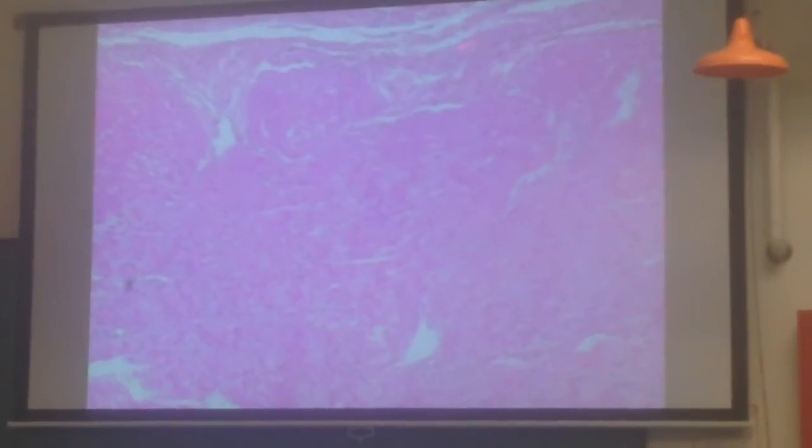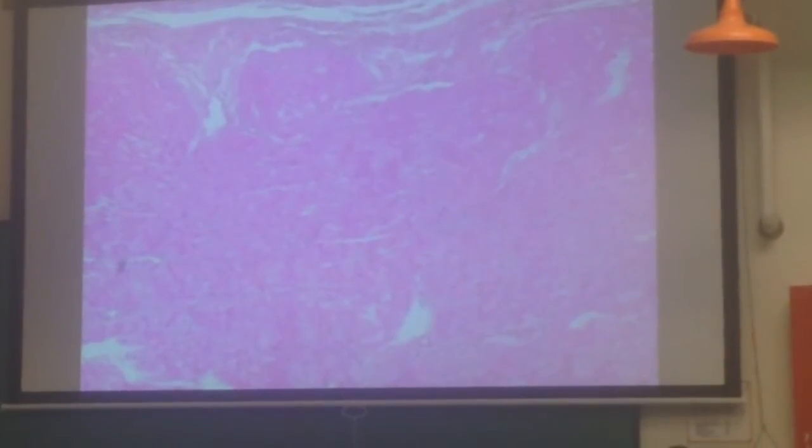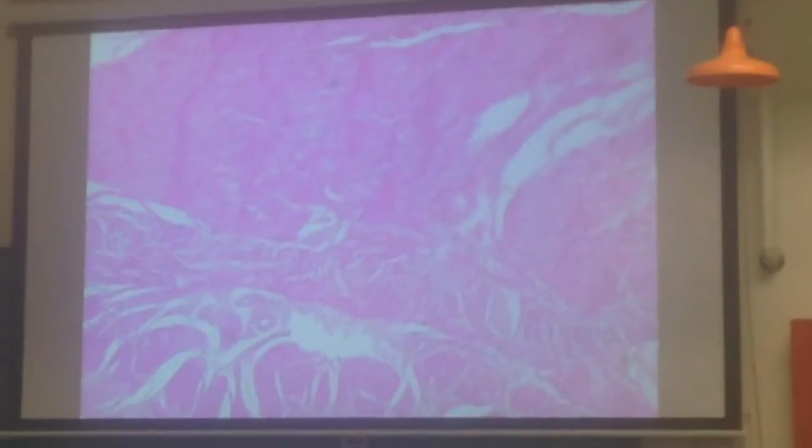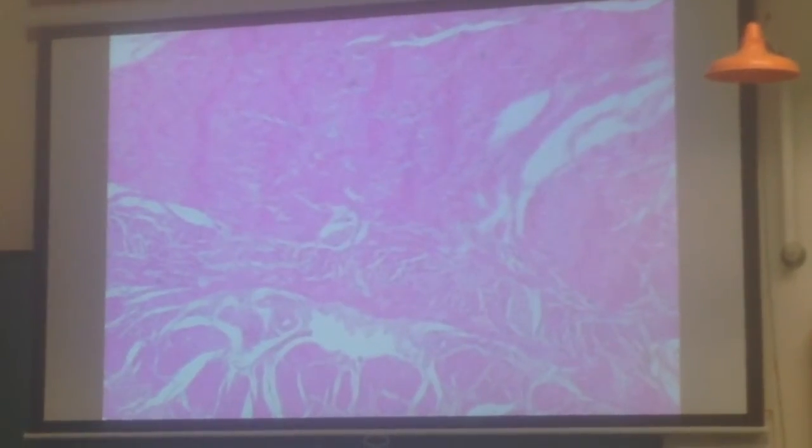I could probably find a little better slide here. I'm moving around too much currently. But the oblique is going to look like it's sitting in there, like I showed you the other day in your picture. That's where I found a better spot earlier, where you see the obliques hanging out in the submucosa, as opposed to when you go down here and see the circular versus longitudinal gradient difference. So in order to see these best, you really want to be zoomed out a little more.